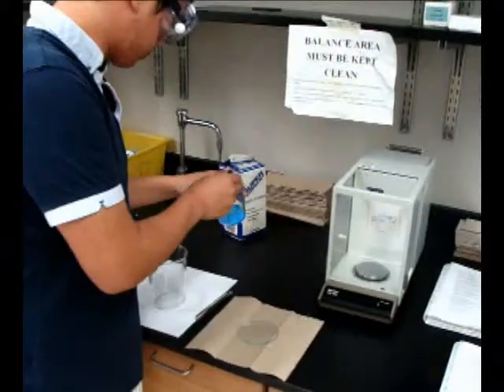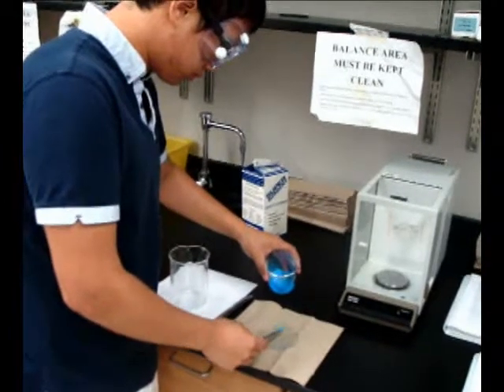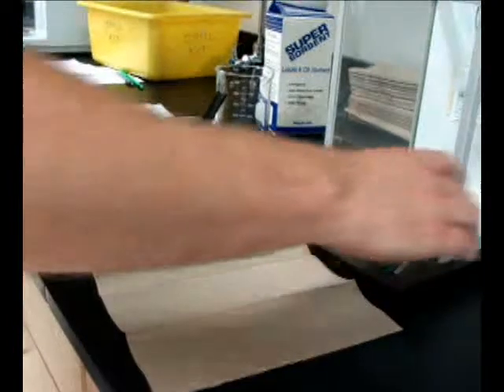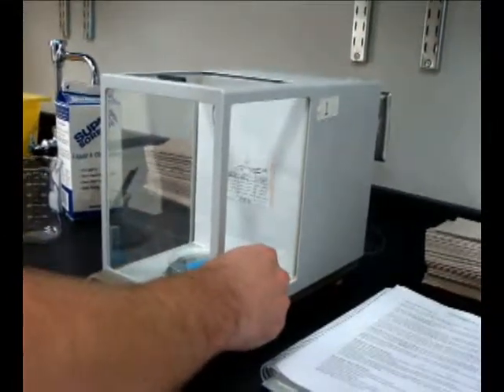Now you are ready to measure the mass of your sample. Place the sample in or on the measurement vessel and then onto the pan. Close the doors of the measurement chamber to keep outside air flow from affecting your results. Record the mass in your notebook. This final mass is the combination of the measurement vessel and the sample.